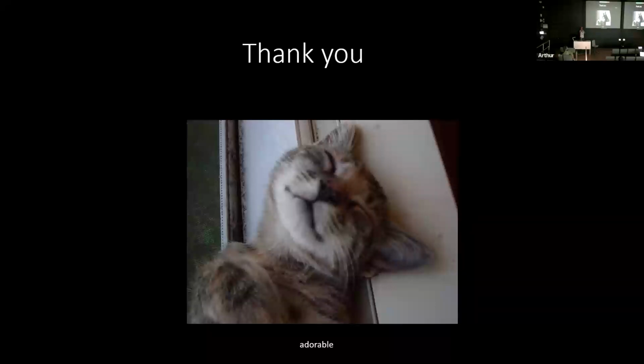Questions? I do have one more question. How do you really avoid the beam damage to the sample, which is kind of a circle? The beam damages the sample.